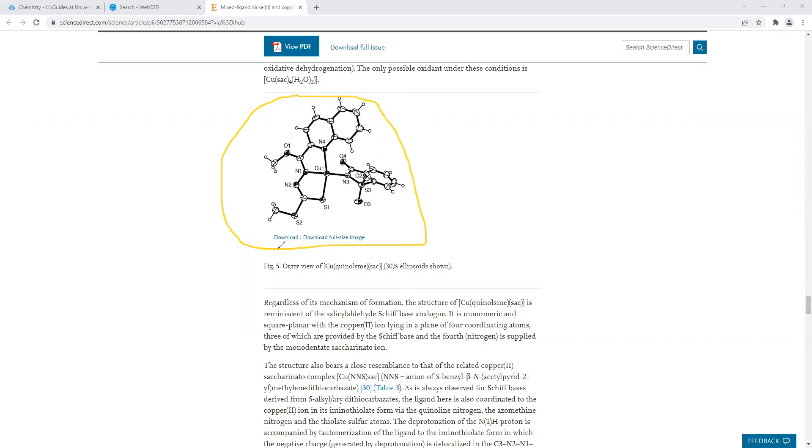You will need to create your own figure heading. Do not use this figure heading here. You need to come up with your own figure heading. Sometimes instead of thermal ellipsoid plot, it's called an ORTEP view. They're the same things. So you would cut and paste this into your report with the appropriate heading and reference this image to this article.